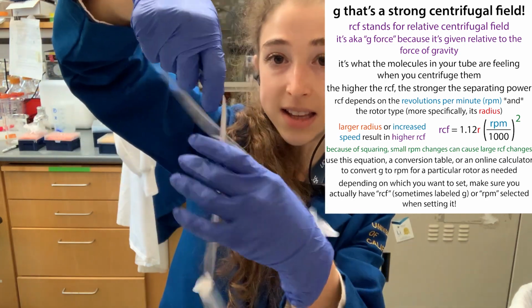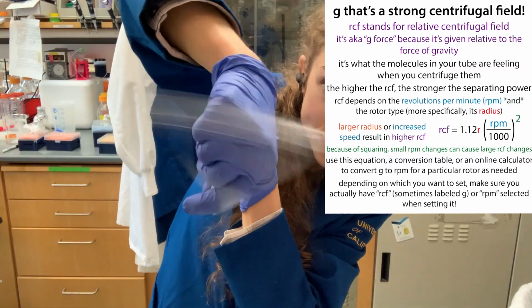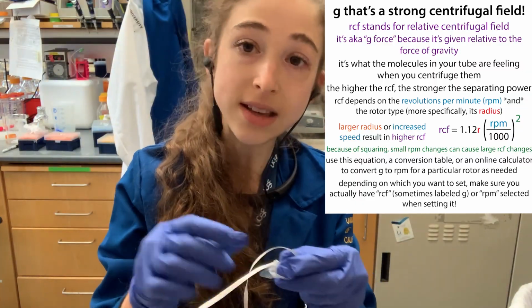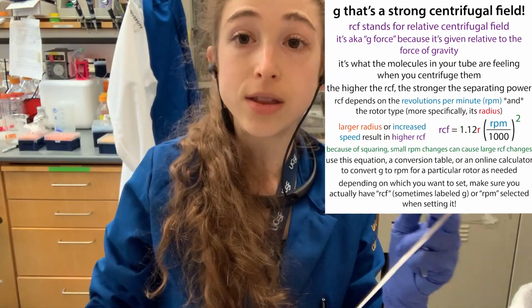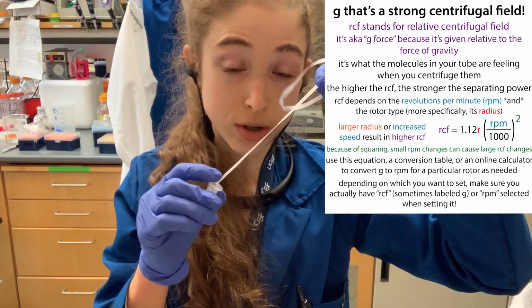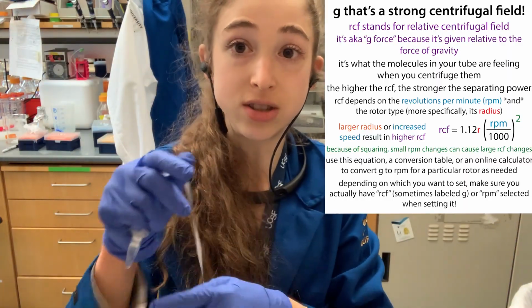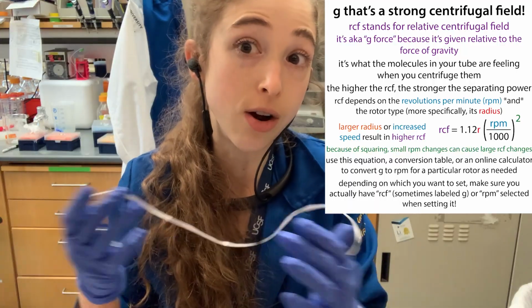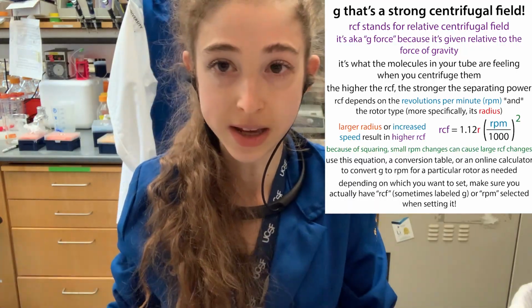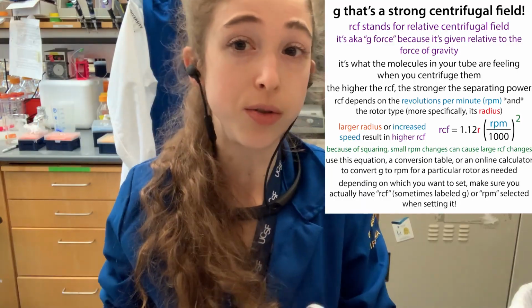And if I lengthen the length of the string, the force at the end of the tube is going to be greater. So how much force is felt is going to depend on the speed, the RPM, as well as the distance from the center of the rotor, the radius. This is why, if you know the RPM, you don't automatically know the force that's being applied. But you can convert between the two if you also know the radius.